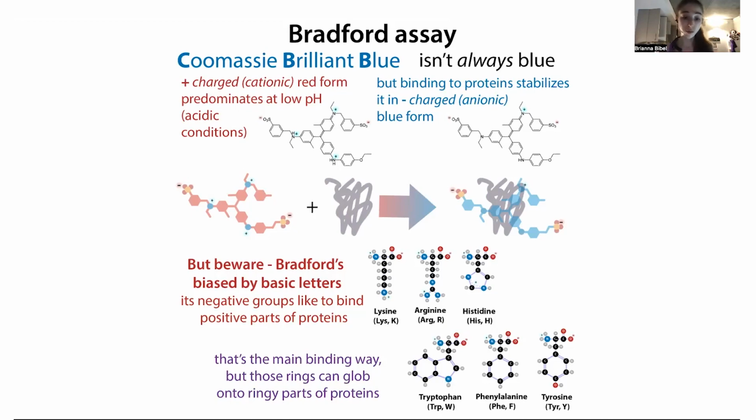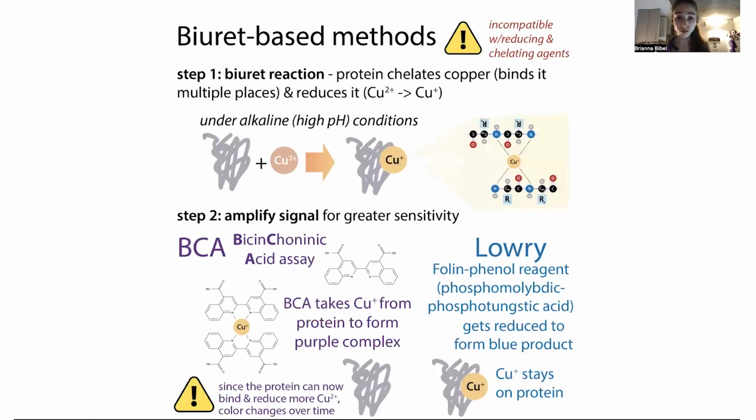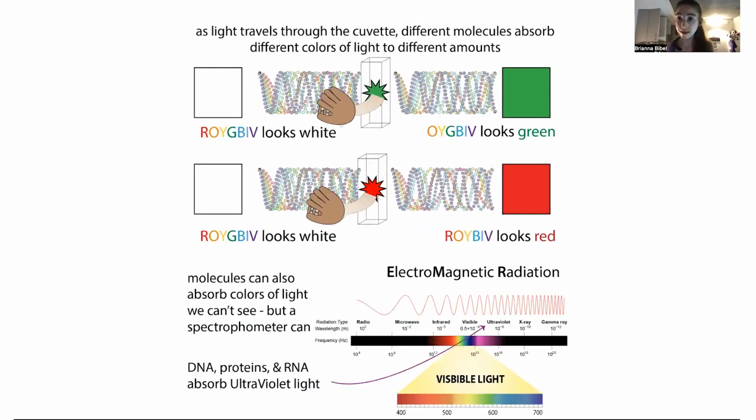And so there are lots of different ways that we can use a colored readout. Sometimes it just changes the charge state of a molecule. Other times we'll have actual reactions that make a colored product from other non-colored products. So there are various ways and times that we use different colorimetric methods in biochemistry.